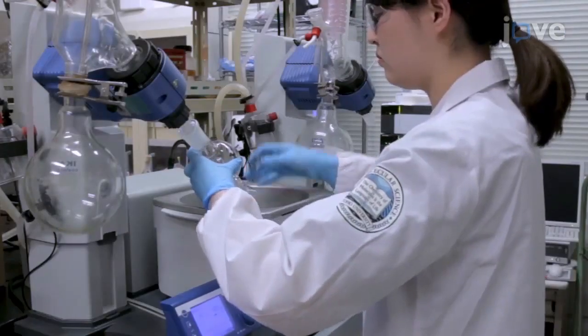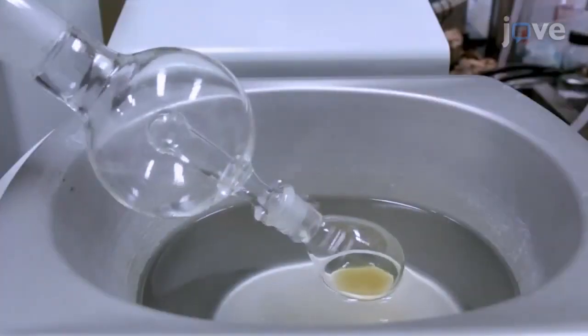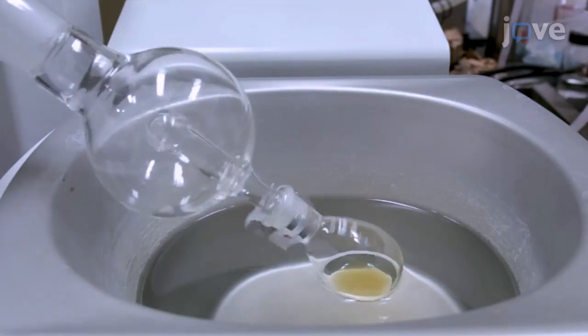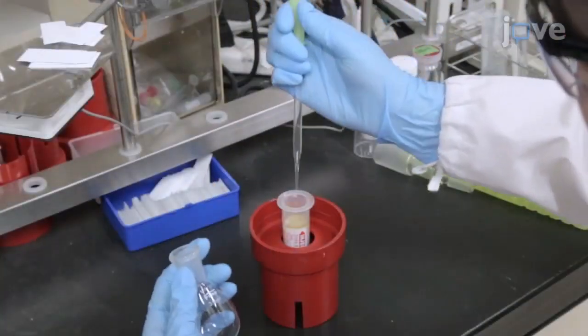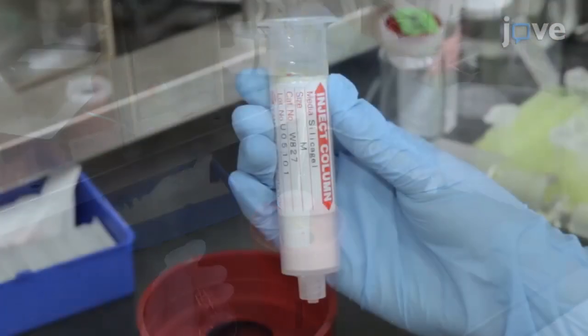Then use a rotary evaporator under vacuum to remove the solvent and other volatile materials, and use silica gel flash column chromatography to purify the residue directly.